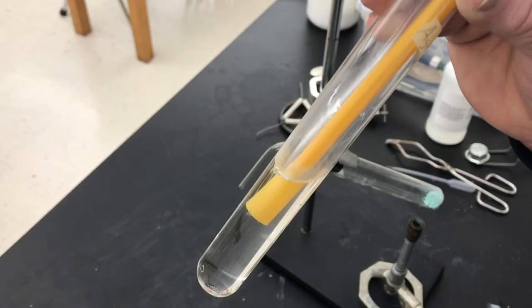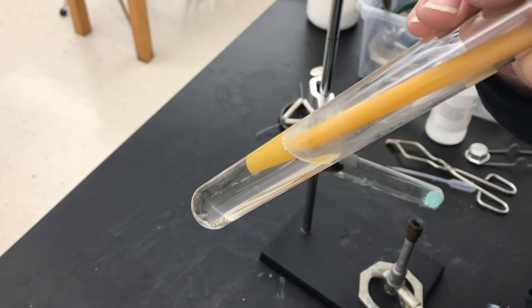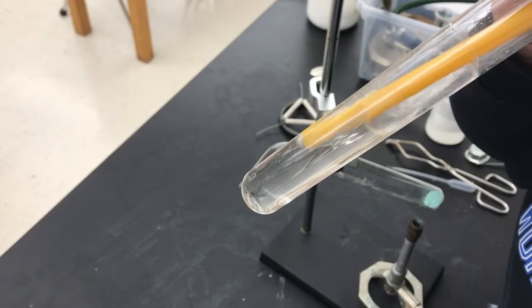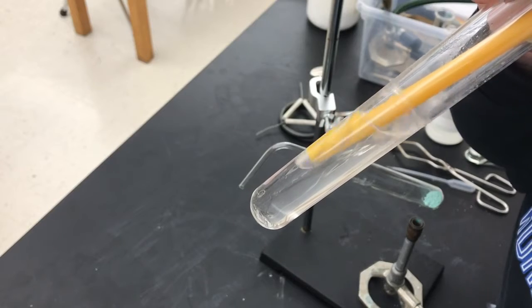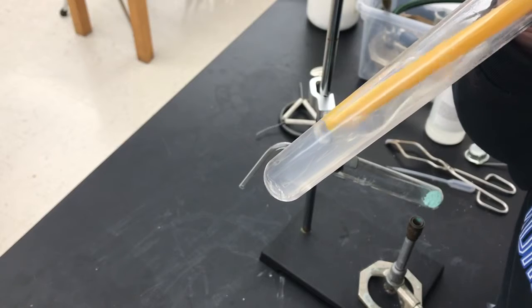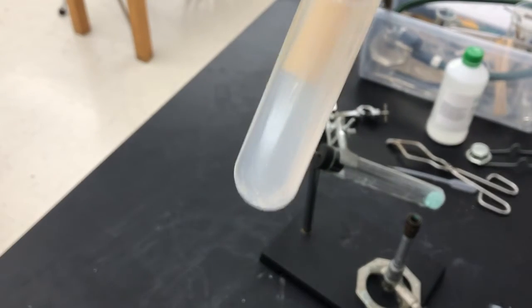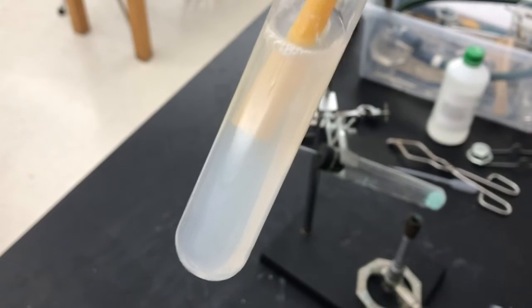So the orange thing I've got here in the test tube is a straw, and what I'm going to do is blow into the straw. I do not suggest doing this at home, of course, but I'm going to blow into the straw and see what happens here. So you can see it turned cloudy, and that indicates that there was indeed carbon dioxide in my breath.